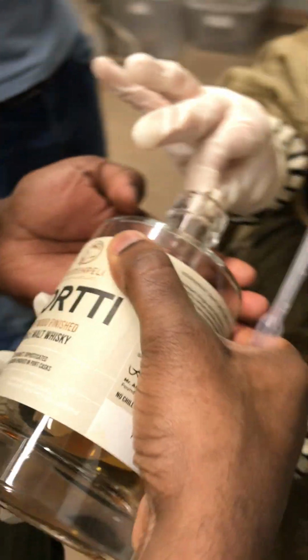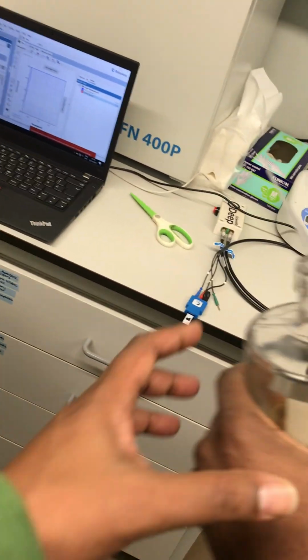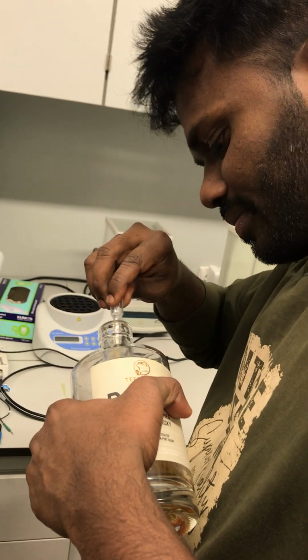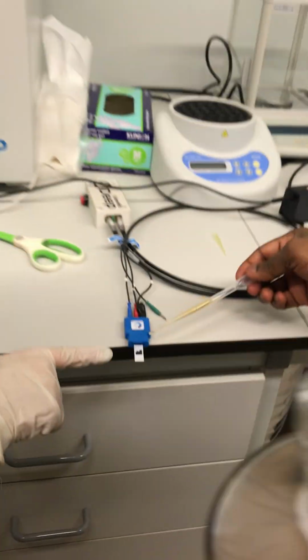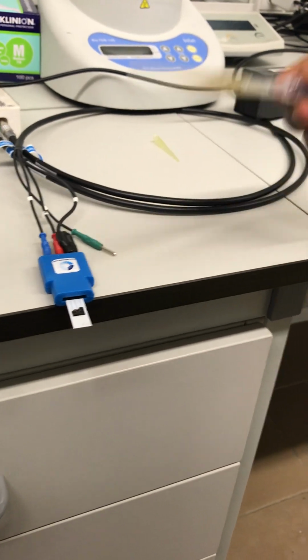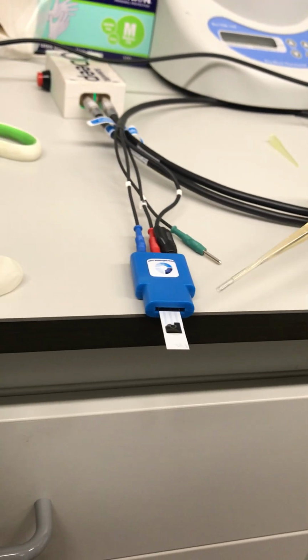It's contaminated. It should not be that much. I think it's better to use this. If that's clean, we can just use it. Sure. Take a bit. Can you apply just a tiny bit and make sure it doesn't go to the contact zone? Just a small drop. On this contact zone, like I did before, the area of carbon. Yeah, one more. You see? Can you do one more drop?